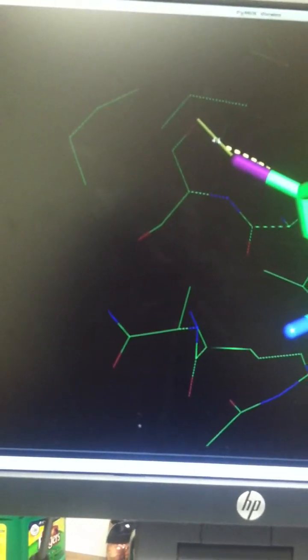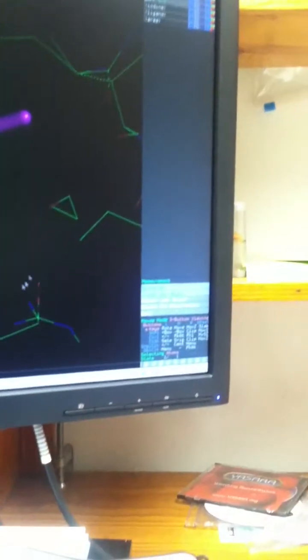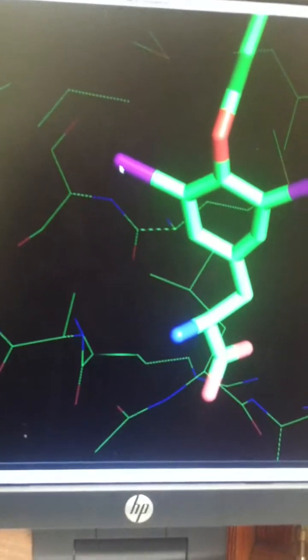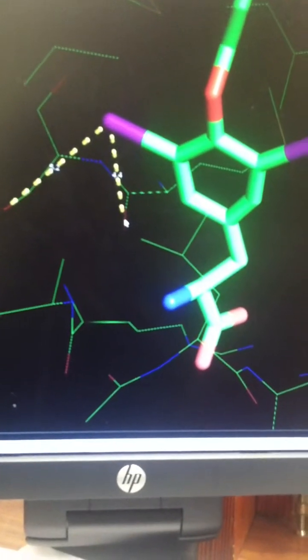So let's delete all measurements. Now look up the distances again. Sorry, I was deleting it over here. You look at the distances. Right now we're going to do distances. You can delete all measurements, stuff like that. So anyways, now I'm going to be here. Click on that, it's 5.2, click on that, 4.4.